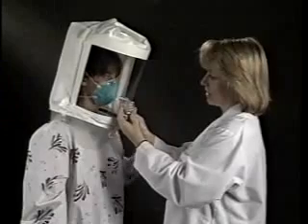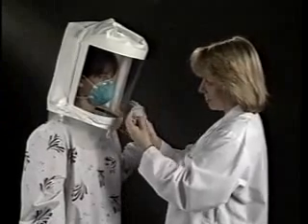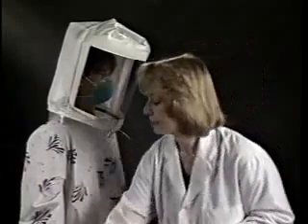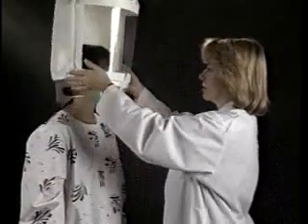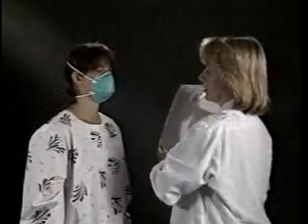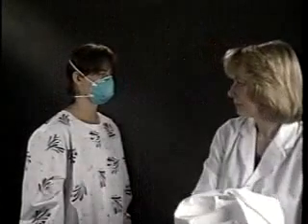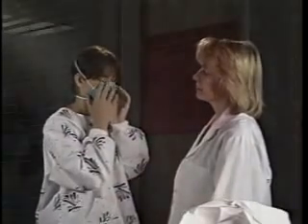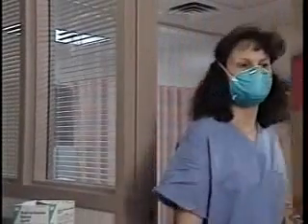If the subject detects a sweet taste at any time during the fit test, an inadequate fit is indicated. Terminate the testing when this happens. Wait at least 15 minutes if you plan to retest. Rinsing the mouth with water helps to remove any sweet taste. The fit test must be completed before a healthcare worker can be allowed to wear a specific model respirator.